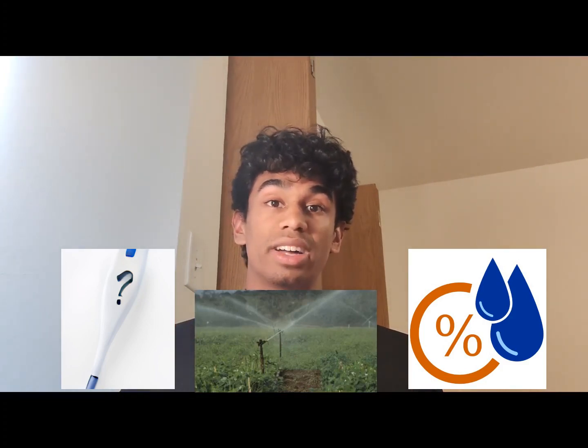So it provides as little room for error as possible, because you can customize all the controls that you want the plant to grow under. This is just a very helpful tool to make a very complex process a good bit easier.